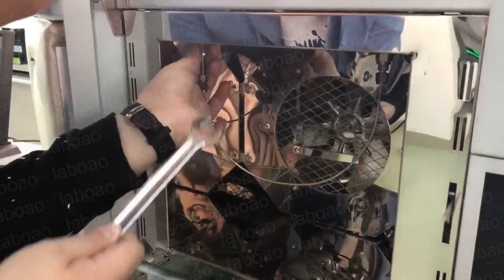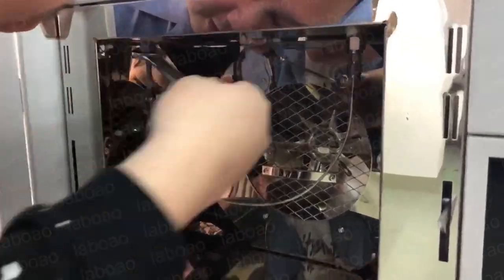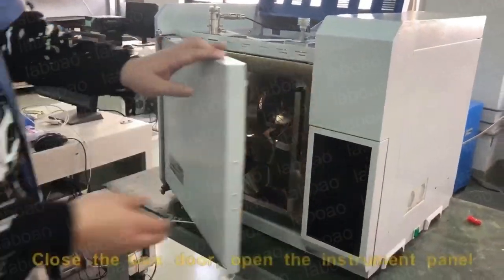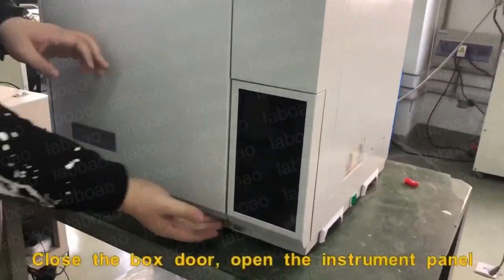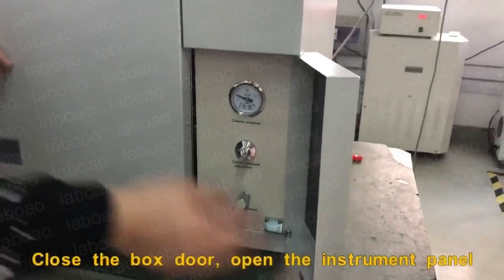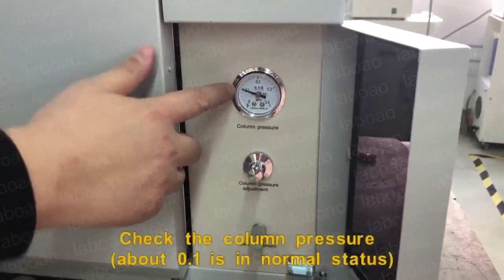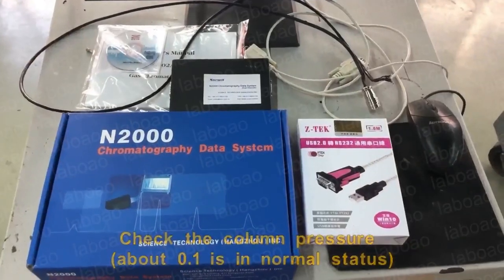Connect the intake pipe again. Close the box door and open the instrument panel. Check the column pressure — about 0.1 is normal status.